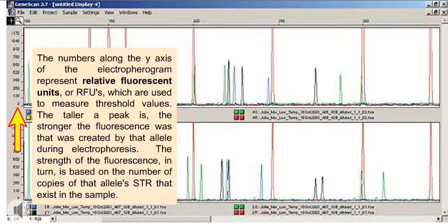The numbers along the y-axis of the electropherogram represent relative fluorescent units, or RFUs, which are used to measure threshold values. The taller a peak is, the stronger the fluorescence was that was created by that allele during electrophoresis. The strength of the fluorescence, in turn, is based on the number of copies of that allele's STR that exist in the sample.